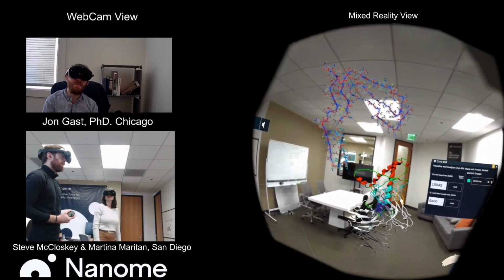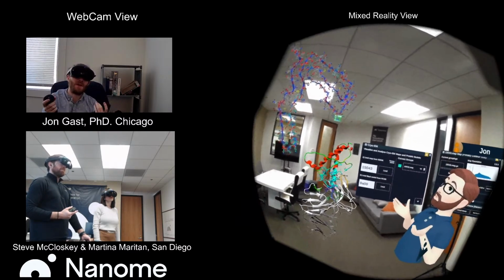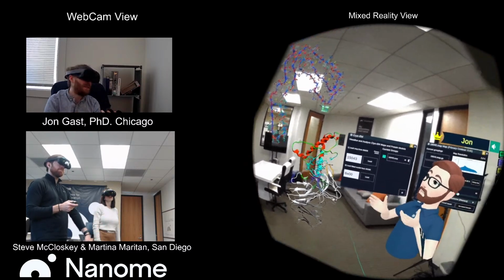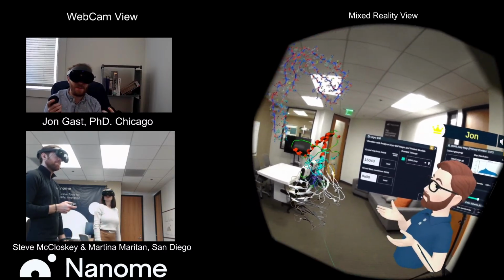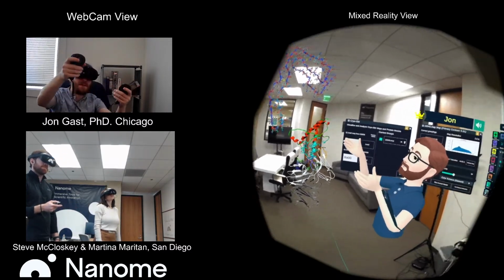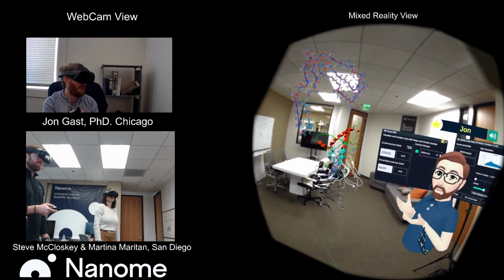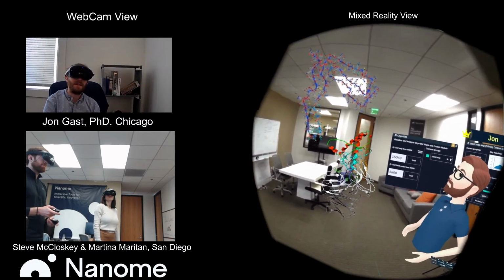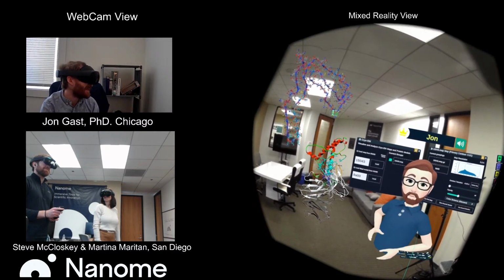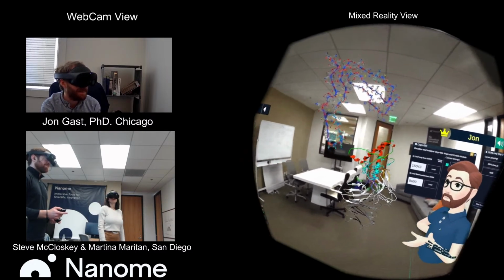So that's a bit of a look at what we can do with some of these larger structures, understanding them really easily and very intuitively by looking at different elements. Obviously, we can also take these same ideas from here and look at other solutions and try to see how all the relationships come together. And it's just really fun to do with some other people in the room, to get the mixture of thoughts and perspectives.